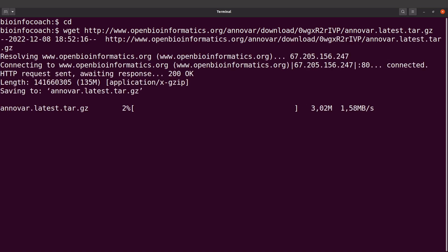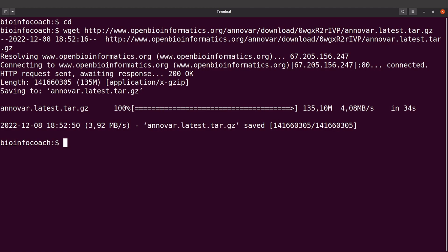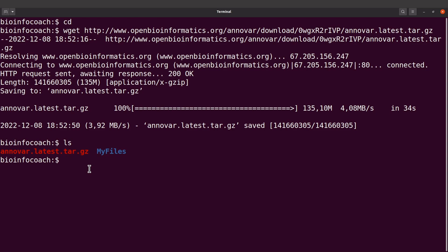The software has been downloaded. Let's wait for wget to get the software for us. The ANOVA software has been downloaded — if I do an ls I'm going to find it here. That has been done.